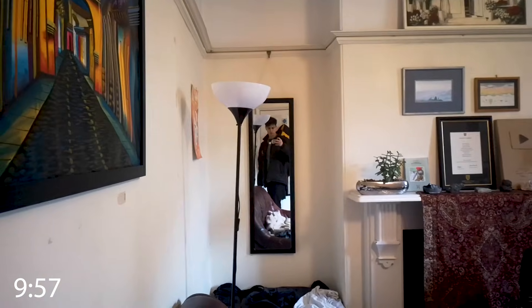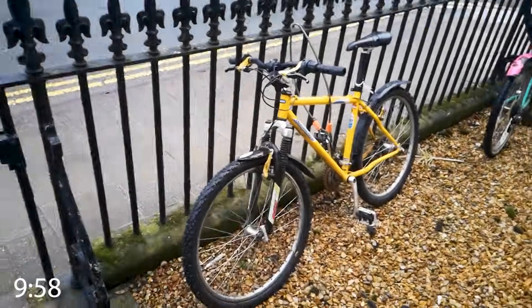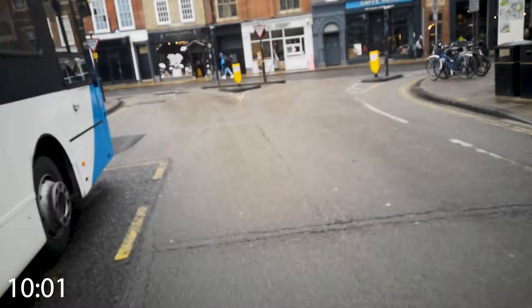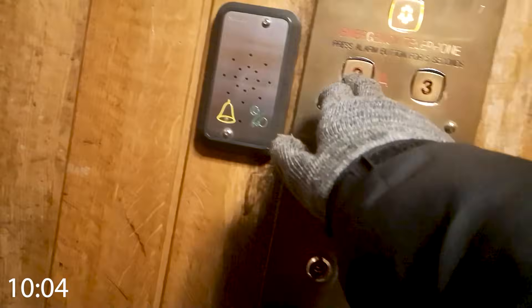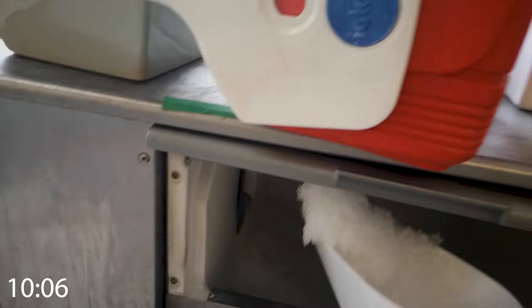I check the mirror to see if it's still working and start heading to the lab. It's literally a two minute cycle away so my leg game is weak. Once in the zoology department I take the world's oldest elevator. I then bust into the lab, struggle turning on the lights and start work by scooping ice into an icebox.